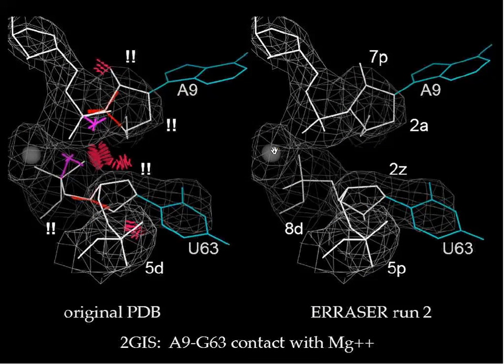Although Erraser does not see the metal ions at this point, and it has individual torsion angle targets, but it doesn't explicitly use our legal list of 56 conformers, it almost always comes up with them, which I find extremely impressive and kind of surprising. Anyway, this is a really lovely fix-up, and it has better ligand geometry to the magnesium even.